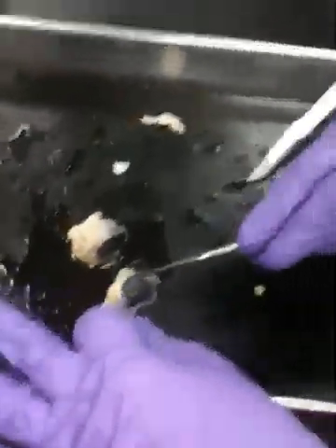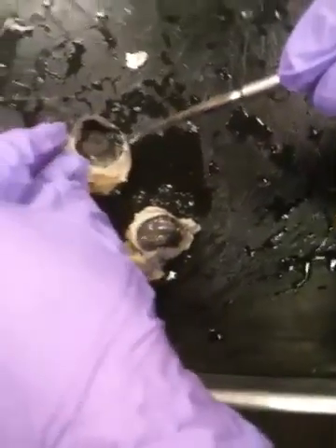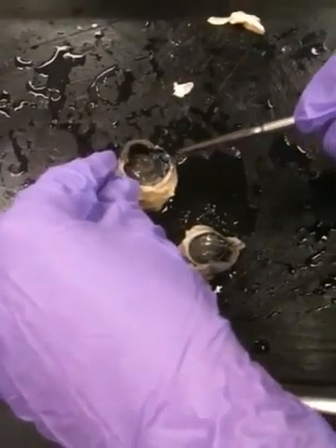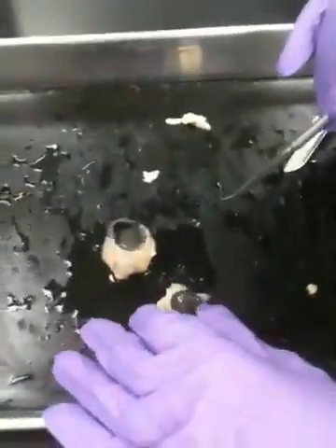Would someone mind? Because it doesn't have greasy fingers near the page. Okay, so we got sclera, which you should be able to see on both of these really nicely. It's the solid, hard, white stuff that you guys were kind of struggling to cut through. Here's some more of it. And then you can see it really nicely. It's definitely something that at some point before you leave today you want to feel, so you get the sense of just how hard it is.